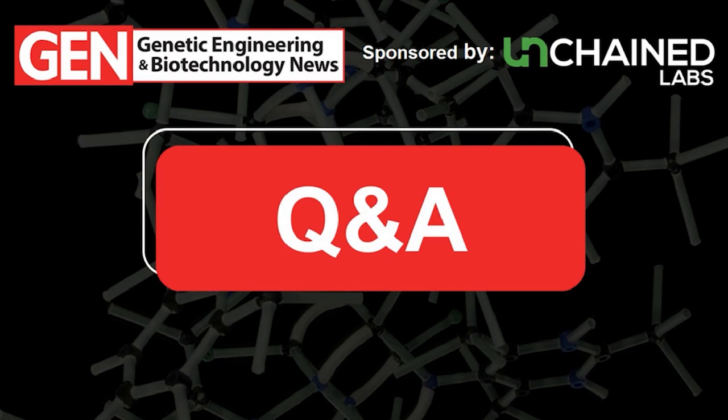All righty, thank you, Audrey. Kevin, back to you. An audience member says, I'm working with a custom AAV and not a default serotype. Will that still work? Yes. So in Stunner software, we put a lot of effort into making it very, very easy to just sit down with any kind of custom AAV that somebody has. If you have a naturally occurring serotype, you can pick that from a drop-down menu.